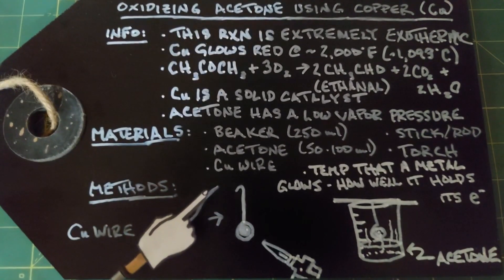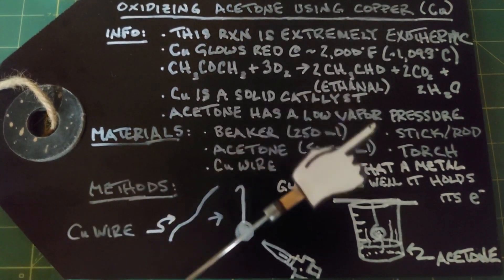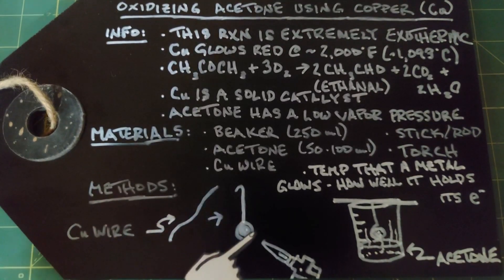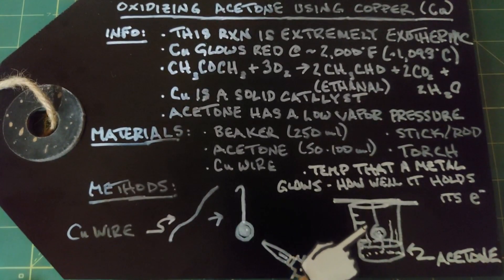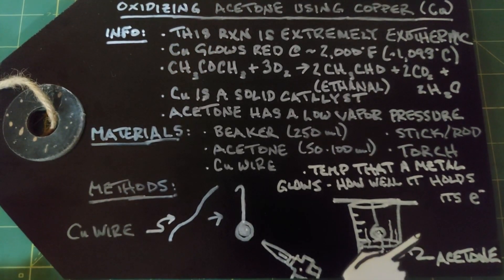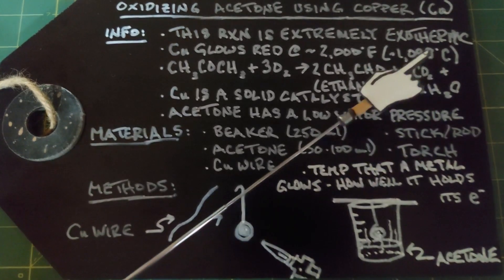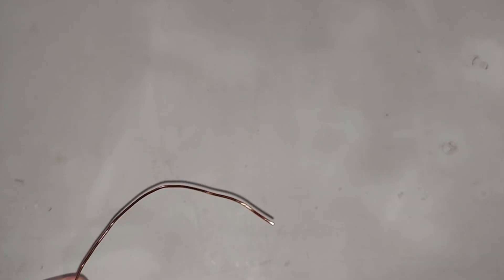For our method, we're going to take our straight copper wire and create a coil at the bottom by bending it, then create a hook at the top. We'll have a beaker with acetone in it, and we create a hook on the top of the coil - it's all one piece of wire - such that when it hangs on the rod or stick, the coil is hanging just above the acetone. When it's heated red hot, the low vapor pressure of acetone will naturally rise and react, creating the products.